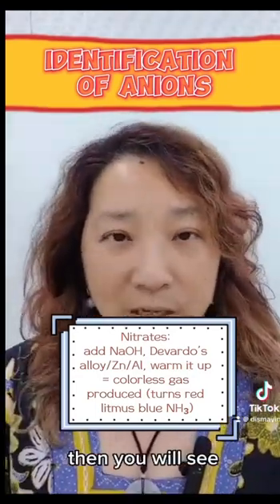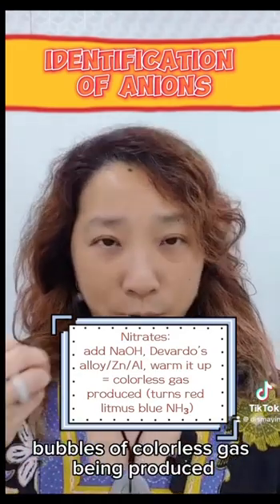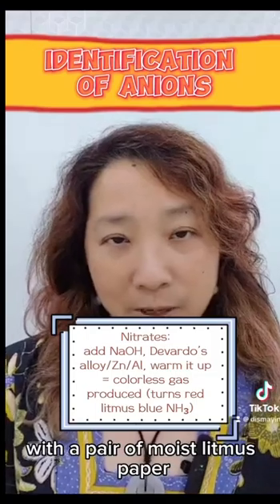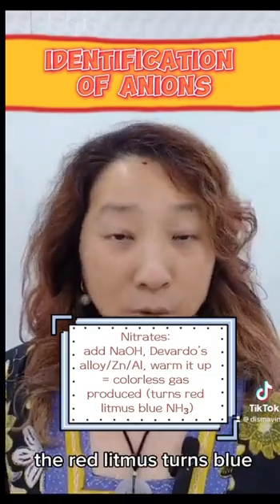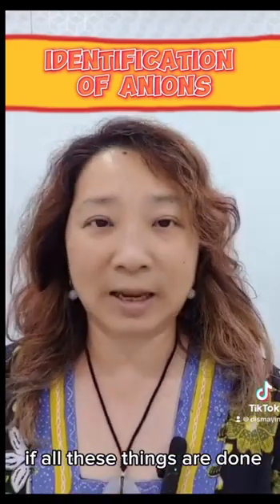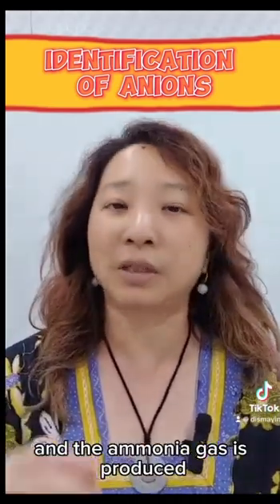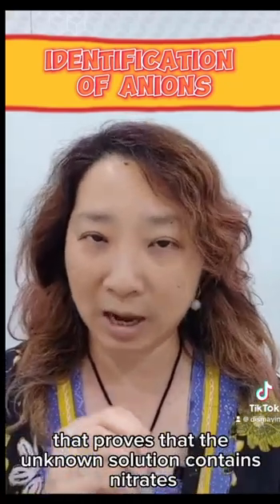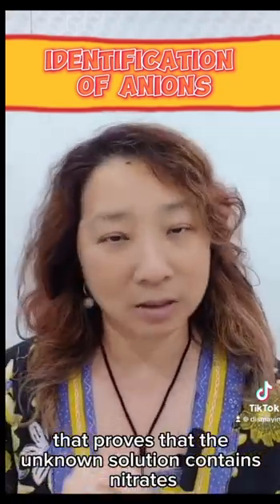And you will see bubbles of colorless gas being produced, and when you test the gas with a piece of moist litmus paper, the red litmus turns blue. In other words, you've just produced ammonia gas. If all these things are done and the ammonia gas is produced, then that is your confirmed outcome that proves that the unknown solution contains nitrates.